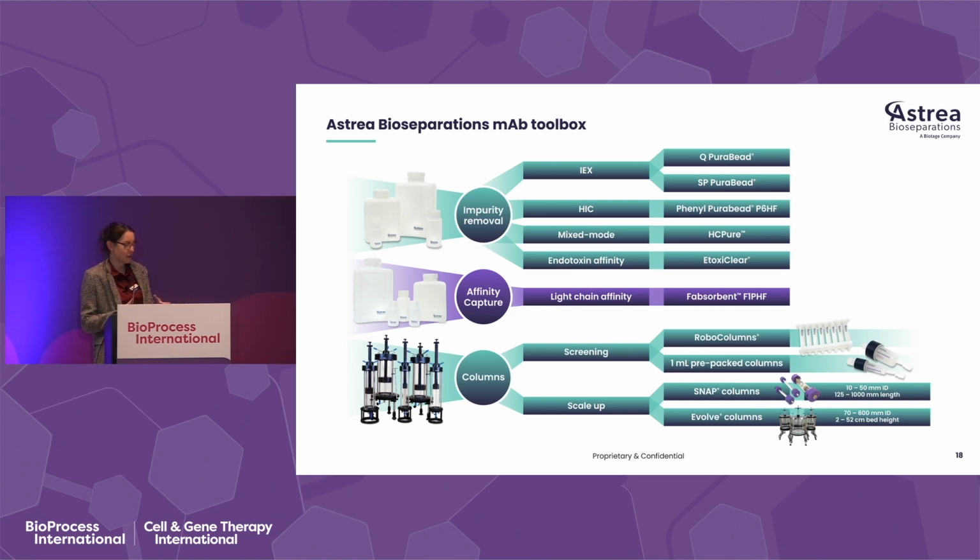Like I said, there are some general properties that you can take from that, like using high conductivity to drive the hydrophobicity, but you would still have to screen it because we don't know how that would impact the product recovery. But it'd be great to be able to just type in the condition and then know what the result would be.